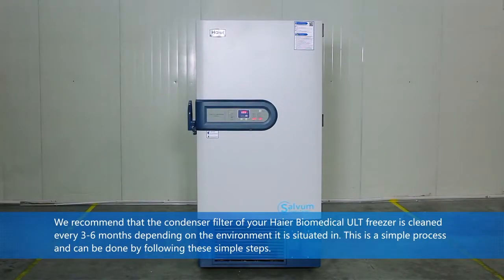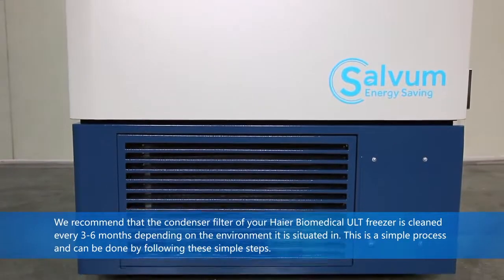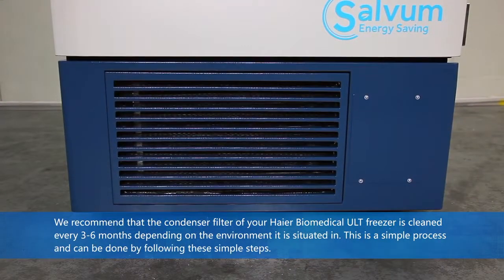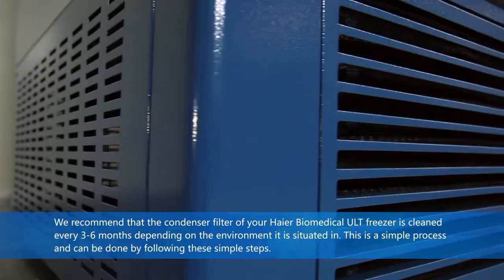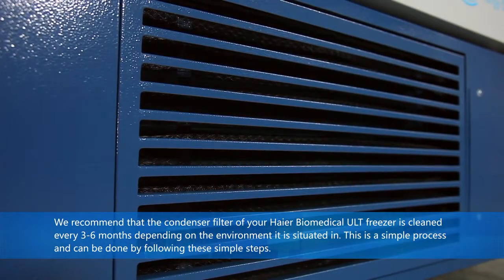We recommend that the condenser filter of your Haier Biomedical ULT freezer is cleaned every three to six months, depending on the environment it is situated in. This is a simple process and can be done by following these simple steps.